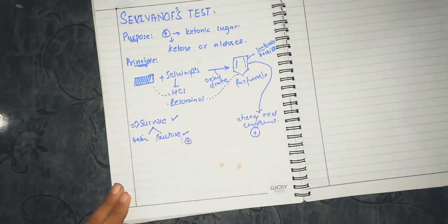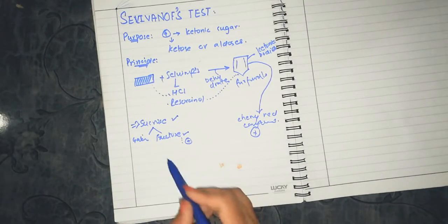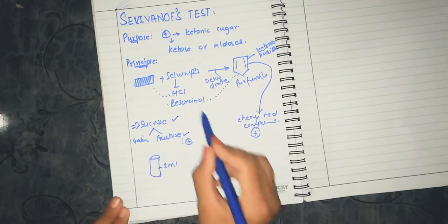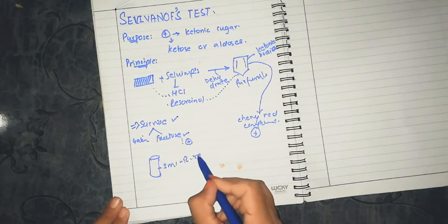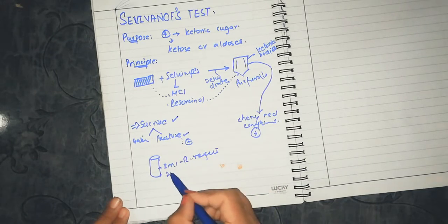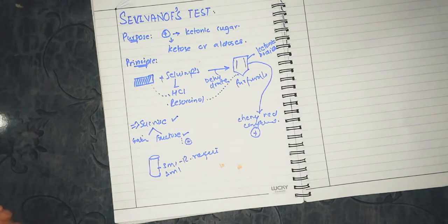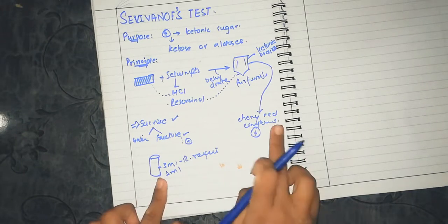The procedure is very simple. In a test tube, we take 3 ml of resorcinol reagent, then add 1 ml sample. We mix it, boil it, and observe. If you get a cherry red compound, the test is positive.